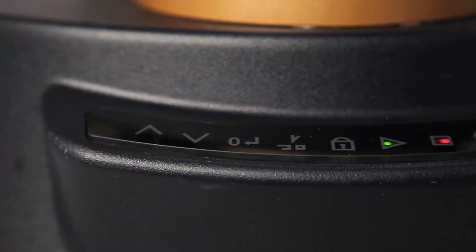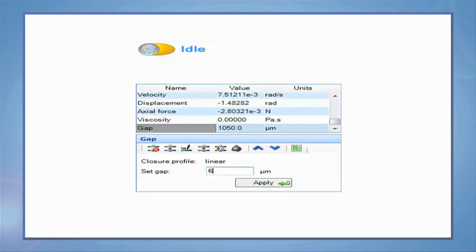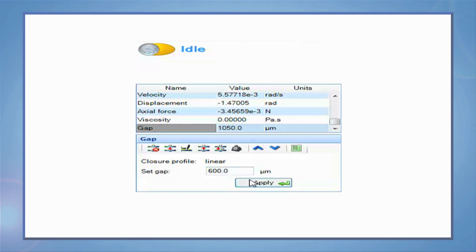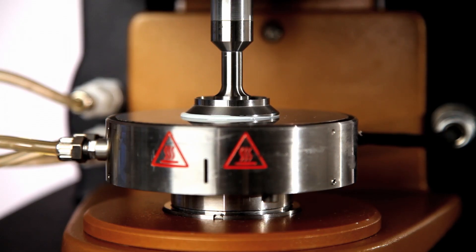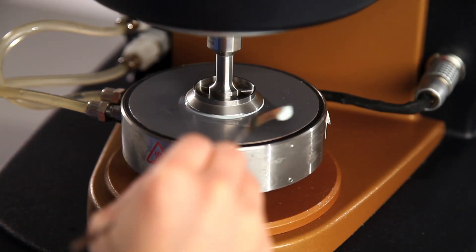The gap can be modified using either the arrows on the touch panel in the front of the rheometer or the gap control panel in TRIOS. Lower the gap until the correct fill is seen or if an excess is noted then sample trimming can be completed.